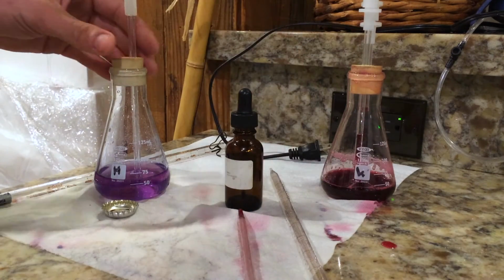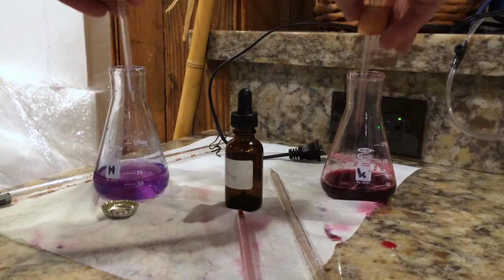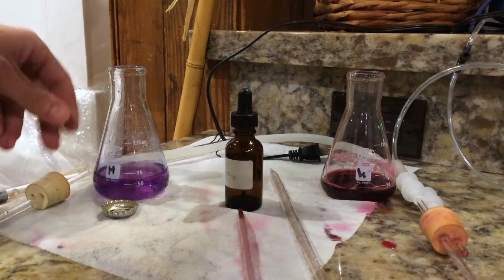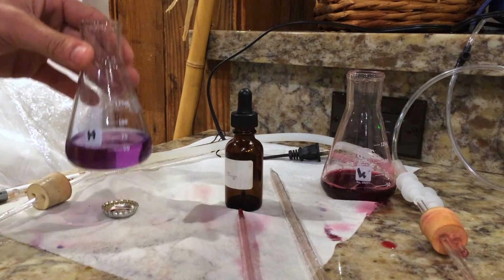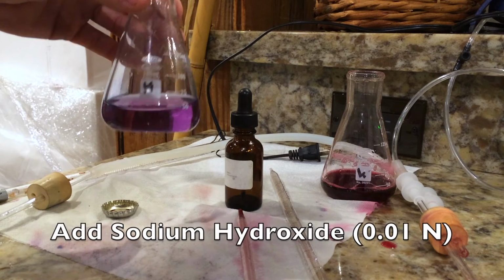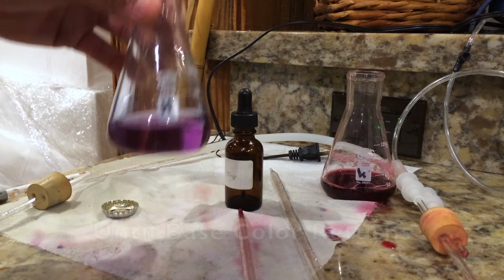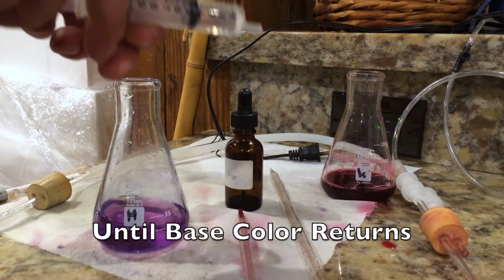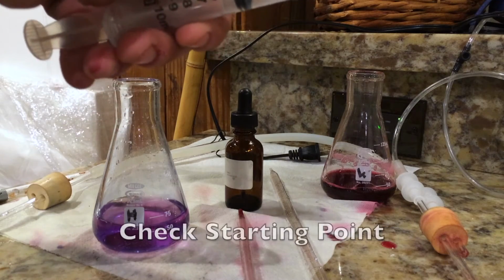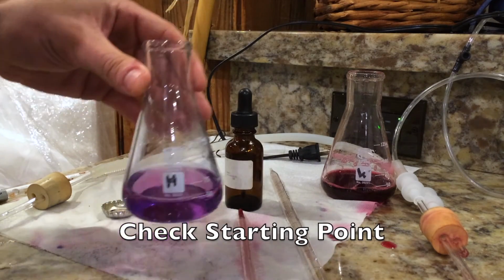So we ran our test for 12 minutes. Now let's see how much SO2 we have and how much we need to add. So now what I'm going to do is add the 0.01N sodium hydroxide and see how much it takes to get this back to the base color. So you've got to make sure you don't have any air bubbles in your tube here. No air bubbles, and then make sure you see your starting point. So right now I am at 4.2 ml.